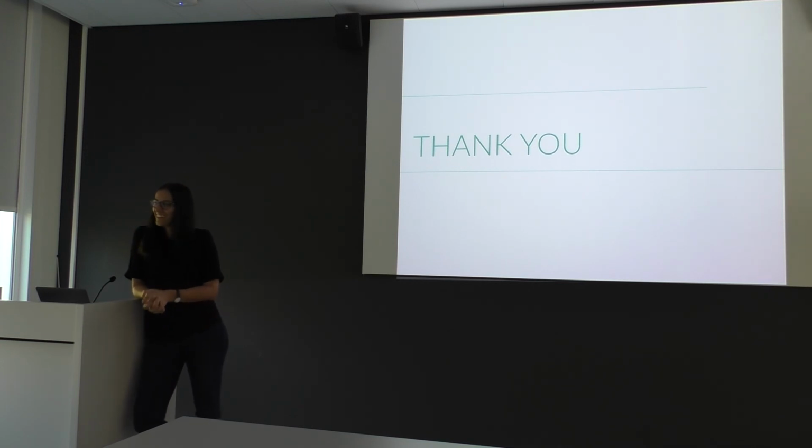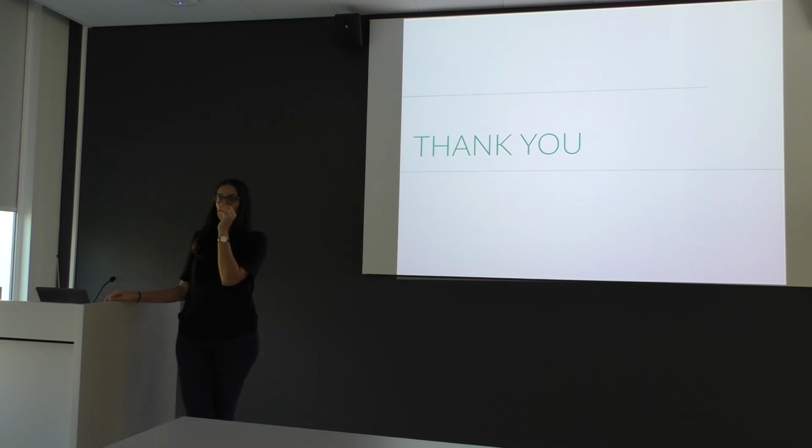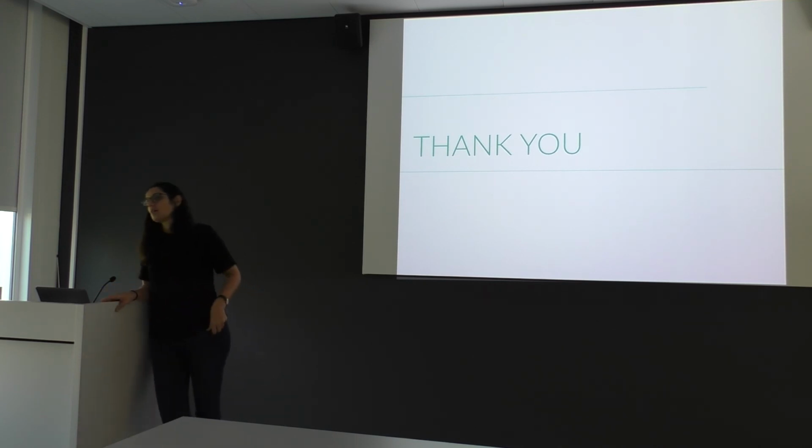Have you done tomography? Have you tried for tomography or not? Not really, no. But isn't the Arctica stage still the ultra stable stage? It's supposed to be the ultra stable stage. That's what FEI wants you to believe. Yeah, it's definitely not. So is this the ultra stable stage that, for example, Francis has? It's this Arctica stage. It's this stage. It's no different.